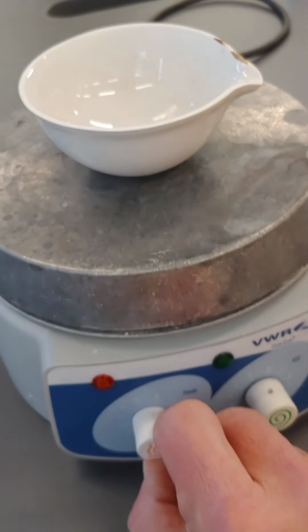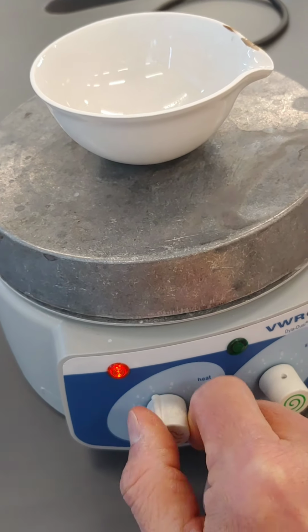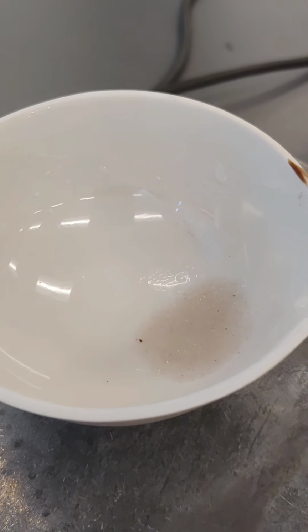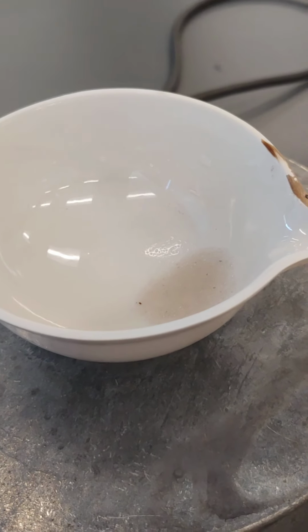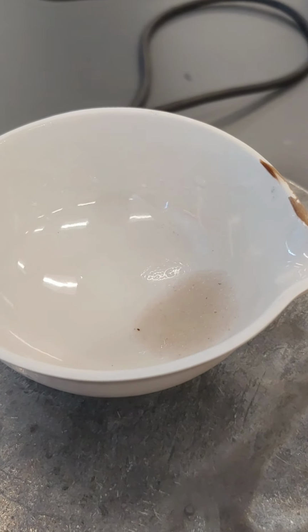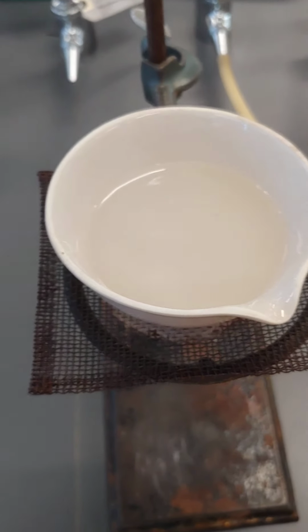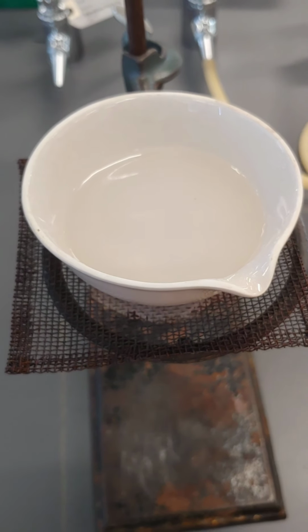So I'm going to heat that up just to evaporate off the water and then end up finally with dry sand. And then I'll weigh that when that's all done, and we'll be able to calculate the mass of the dry sand that's left.